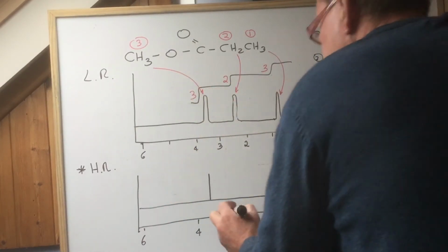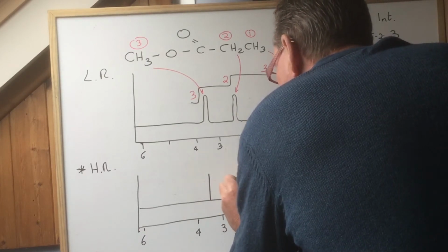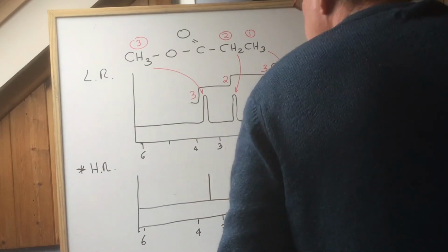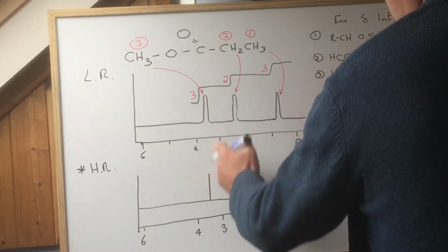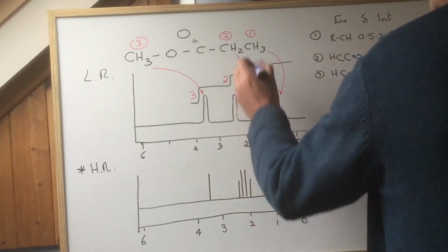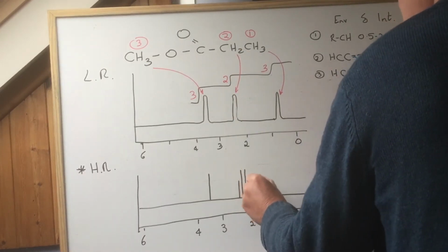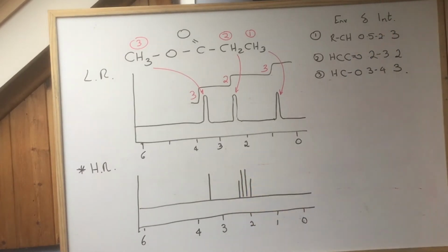You have to look for the integration peak. So how high they are is irrelevant. 1, 2, 3, 4. That is how it is drawn. It should be the same position as the one. I'm a little bit to the right there, but in terms of chemical shift, it's centered around there. It's that peak split. And the n+1 rule tells me that the protons in that environment are attached to a carbon with 3 protons on it. You get used to this, believe me.